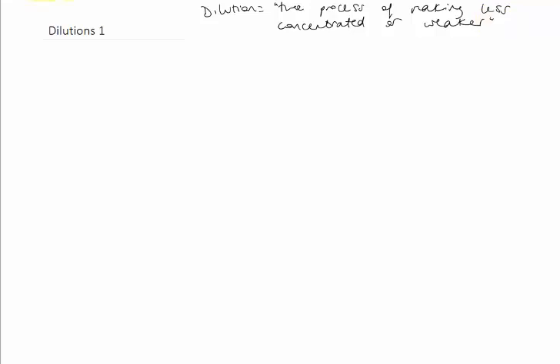And to work out how much we're making it less concentrated by, we use something called the dilution factor. And that describes how much you are diluting your solution.